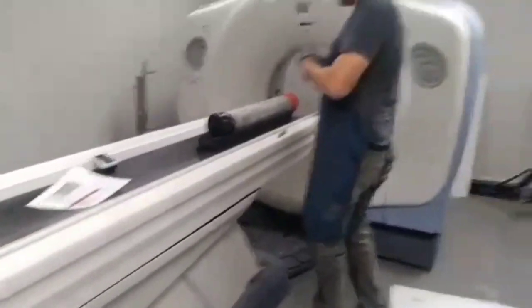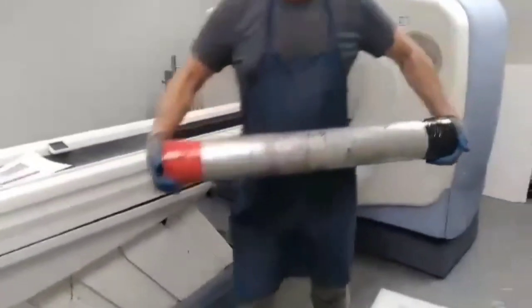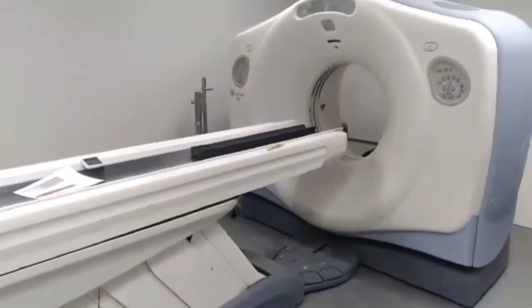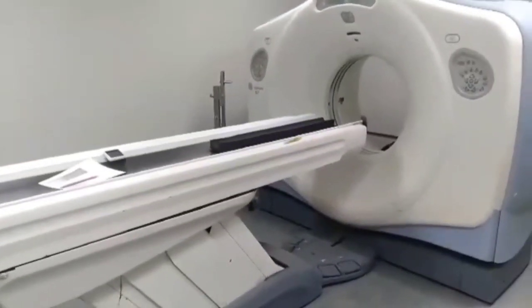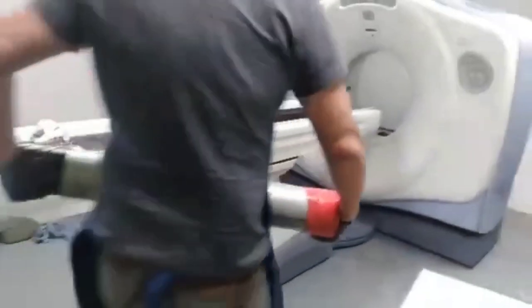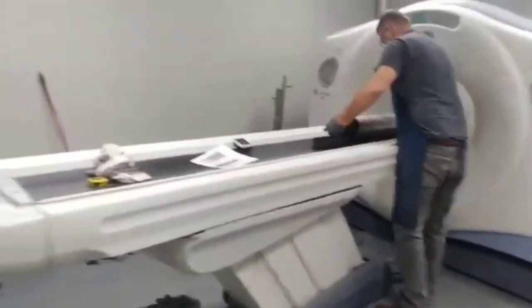This is the CT scan room, and he just scanned the core. Same one they use in the hospital. This one takes 690 photos of a 3-foot core that's 4 inches around. We can't be in here while it's running, so I'm going outside.